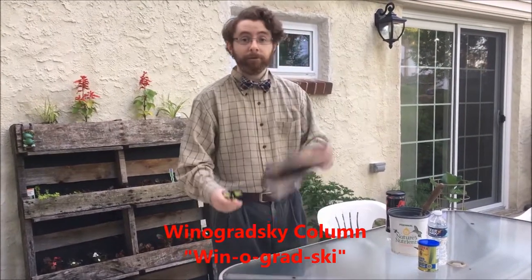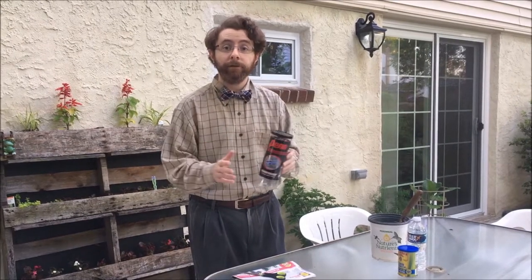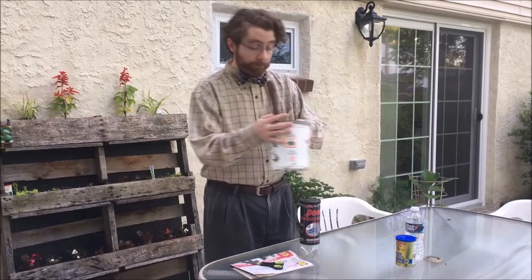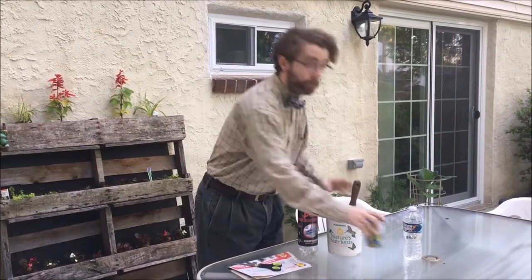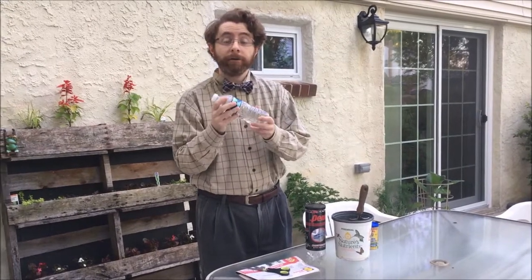In order to do that, you need a little piece of newspaper, a pair of scissors, a clear container. Here I'm using a tennis ball container, but you could easily use a clear soda bottle. Some soil from a local garden, or if there's a stream nearby, some soil from that local stream. Some cornstarch, and some water — either rainwater, stream water, or purified water. Not tap water.